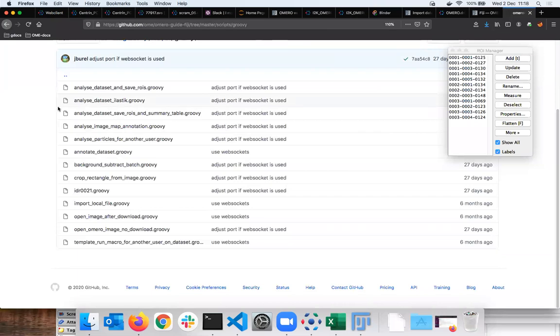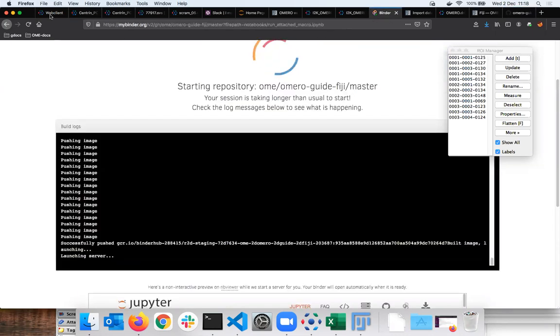So Peter, did you want to show another tool, maybe? Yeah, maybe we can in the meantime, and your image will take ages.